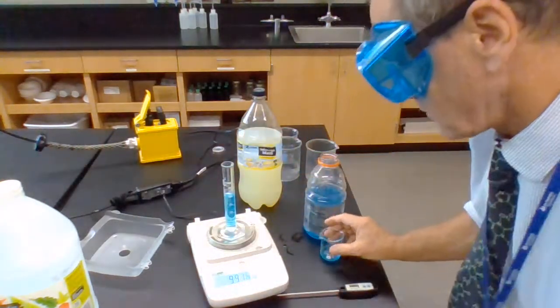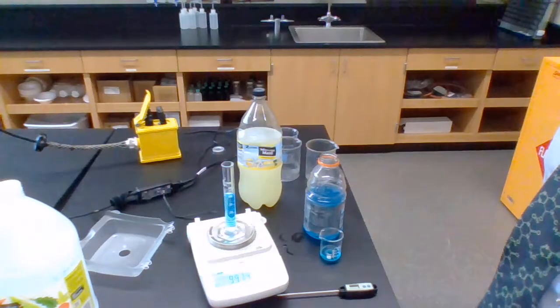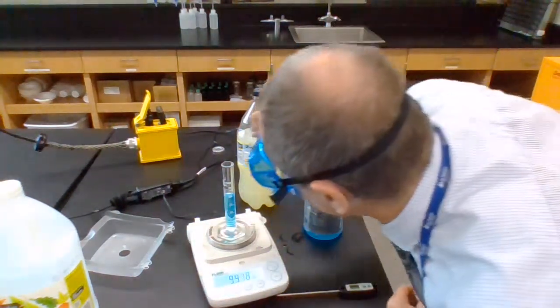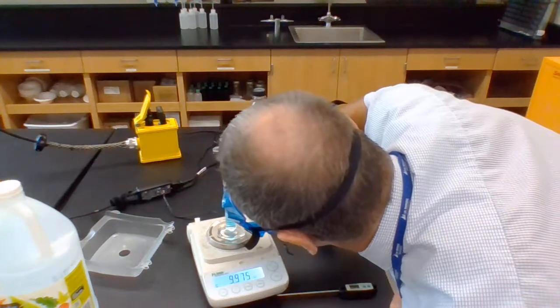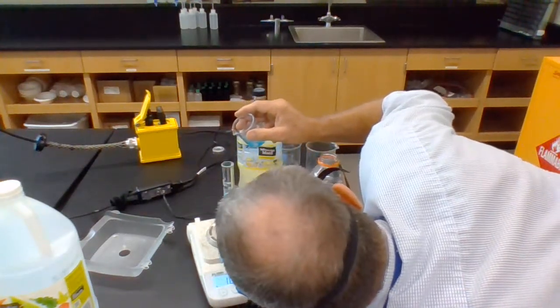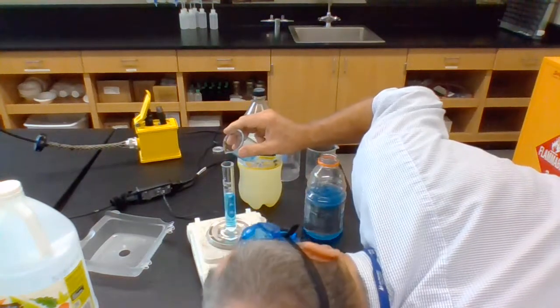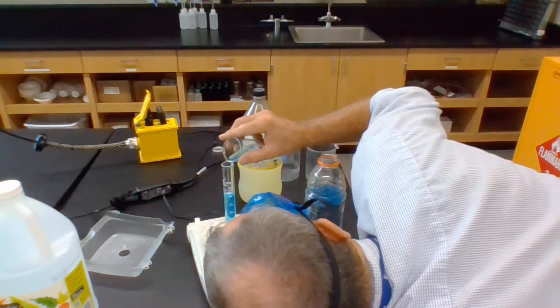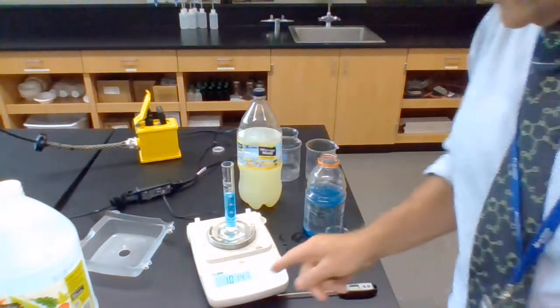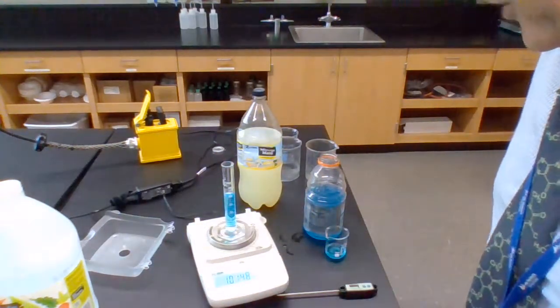Nice. No, top of the meniscus is there. Get a little bit there. That'll do.